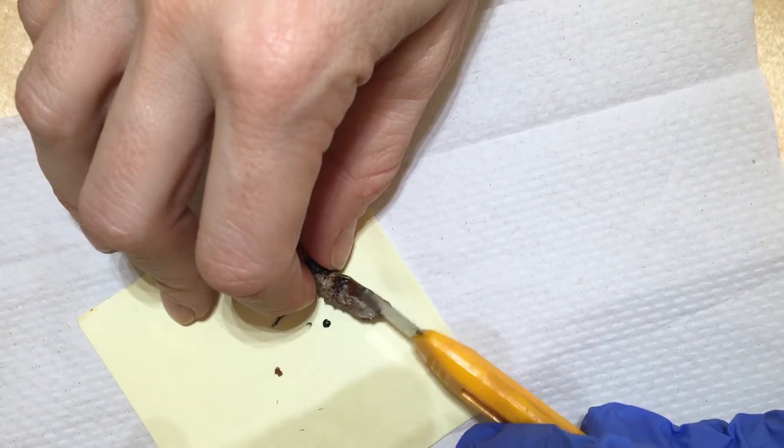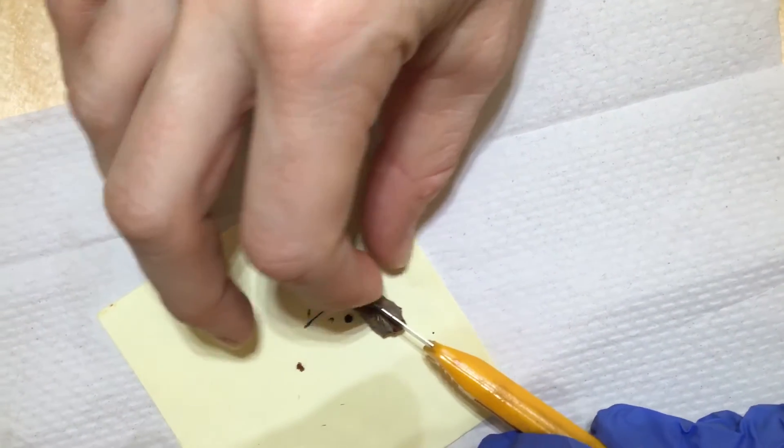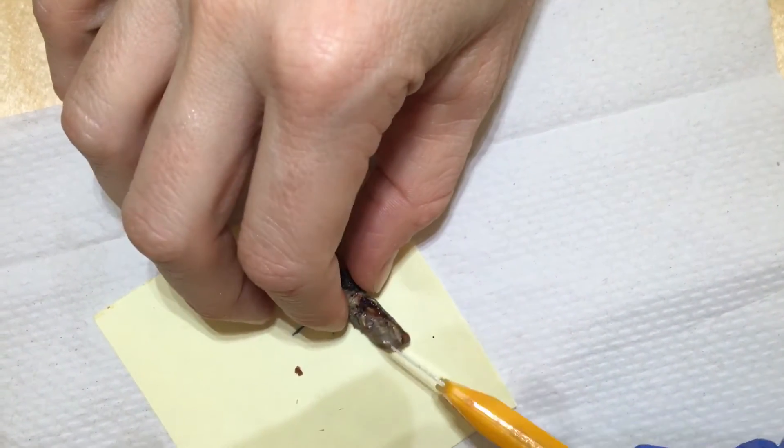She's being really delicate, she's trying just to cut open just the chrysalis part so that we can still take a look to see what's inside.